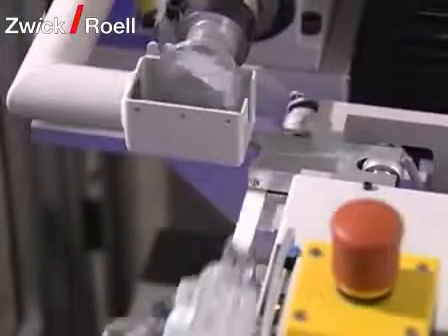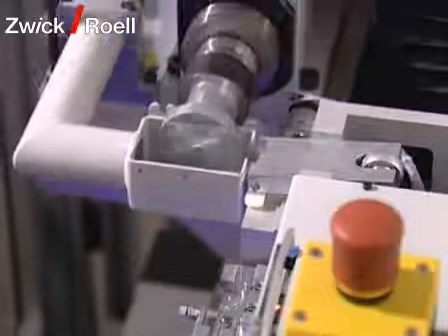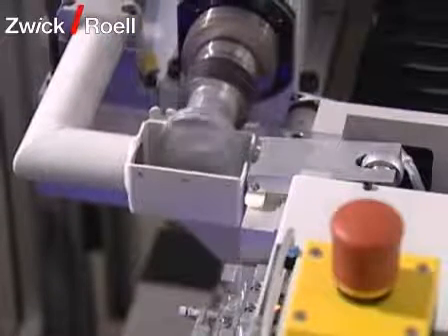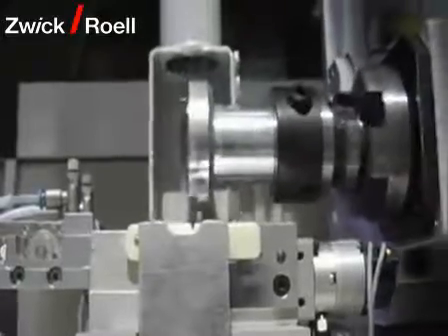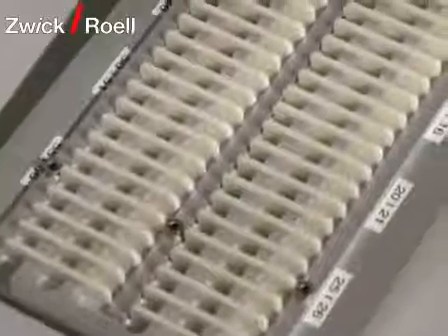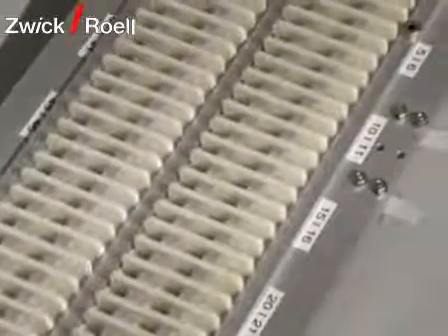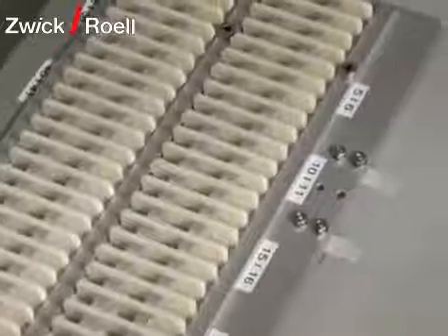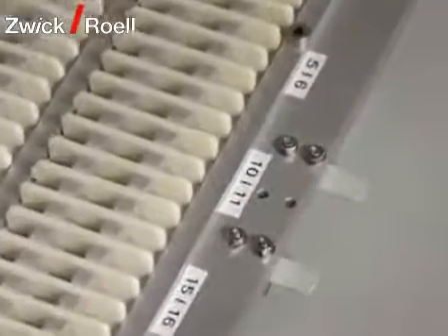Because of the integration of a notch milling unit, the specimens can be placed in the machine immediately after production. The machine automatically ensures that the specimen rests for the required time after the notching process. The variable specimen magazine can hold up to 180 specimens, and the single magazines can be identified with coding slips on the specimen grips, which avoids any confusion.